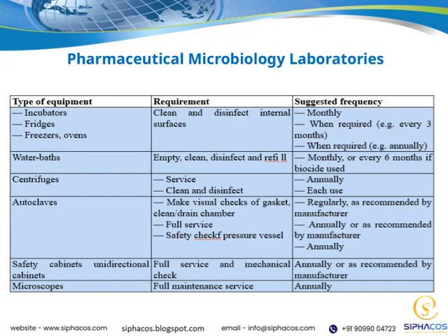Let's take a closer look at pharmaceutical microbiology laboratories. These labs are a critical component in ensuring the safety and efficacy of pharmaceutical products. They are specialized facilities where we carry out microbiological testing to detect any microbial contamination in drugs, raw materials, and the manufacturing environment. The key points here are the importance of maintaining strict aseptic conditions and adhering to regulatory standards.